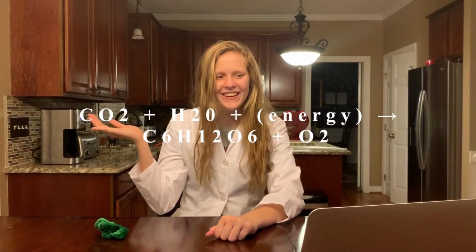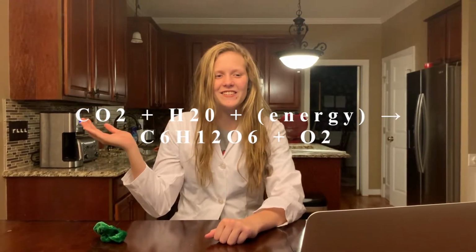Photosynthesis can occur if there is an alternate form of carbon dioxide, in this case sodium bicarbonate, which is exchanged with oxygen through the stomata, and the leaf becomes buoyant. This lab is an indirect measure of photosynthesis. In order for this lab to be complete, one must know the equation for photosynthesis. The equation is the combination of water, carbon dioxide, and light energy to produce glucose and oxygen.